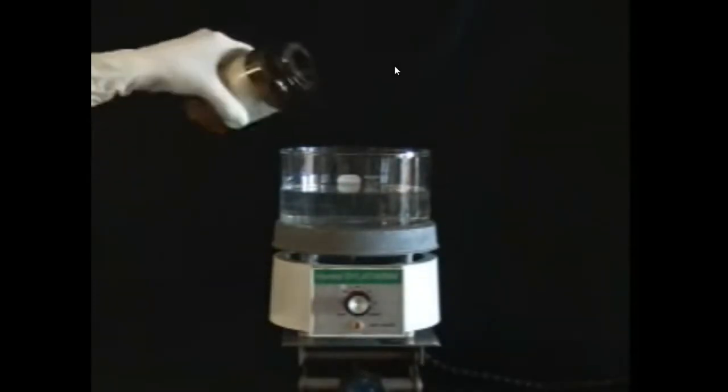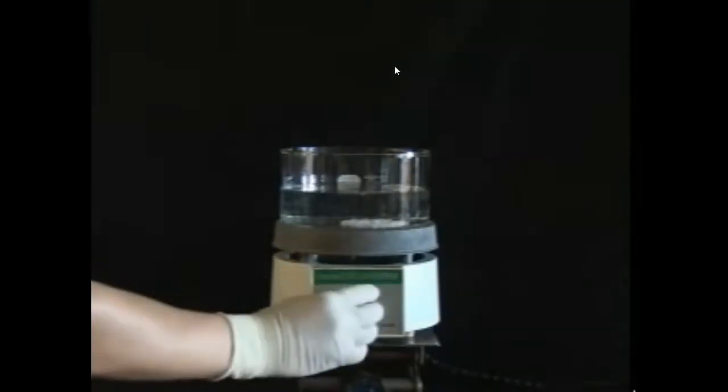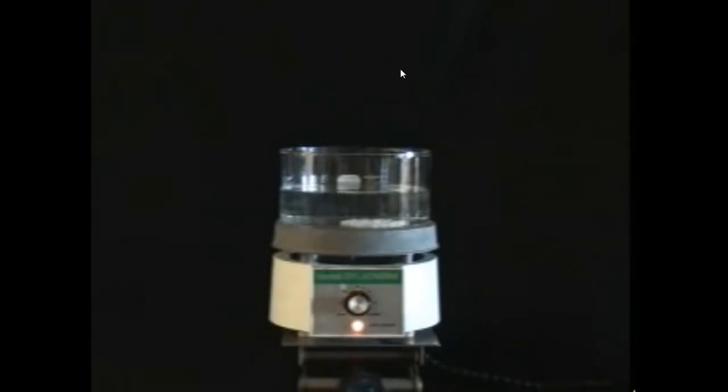To set up a water bath, place a large crystallizing dish about half full with water on a hot plate. Add some boiling stones and turn on the heat. Don't turn it up all the way. Start halfway and adjust from there.